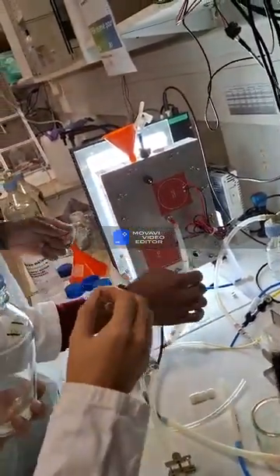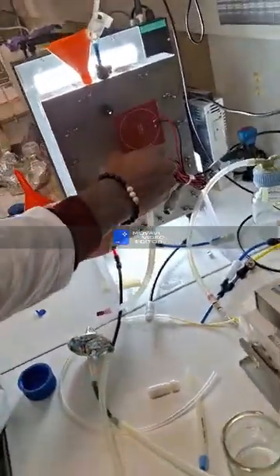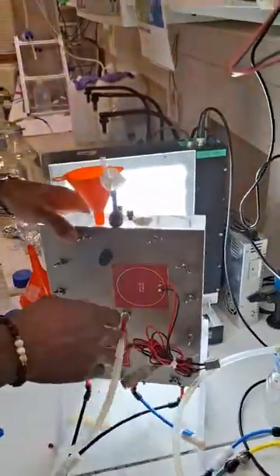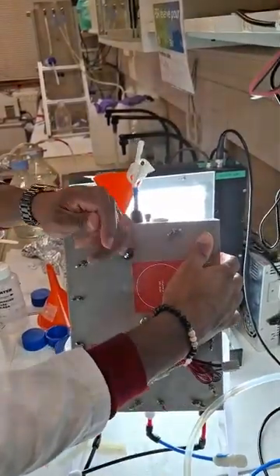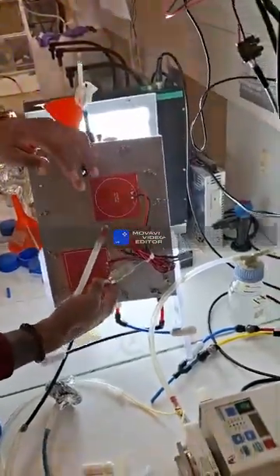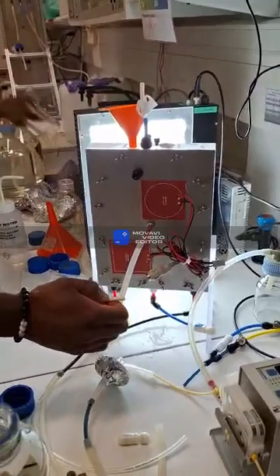It's not a big deal, but here I will have a big leak. Better to put it here, because there is already a lot of water. Here it may flow like this. Here it's too low. So I will use it.